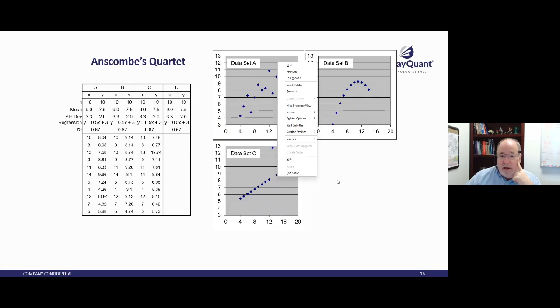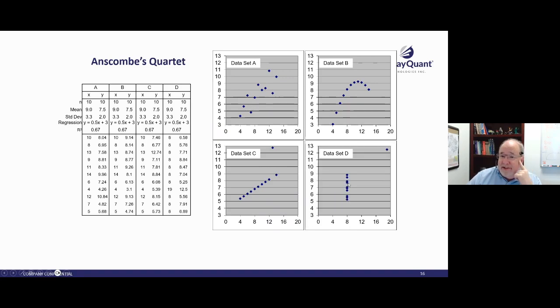You've got a nice straight line like this, but you've got a point that's all the way up here. So your Y-intercept is actually negative. Your slope is significantly lower than this data set here, but it's all offset because of this one outlier. But it still has the same numbers. And by the same token, here's data set D. Everything's 8 except for this. If you crunch the statistics, it looks exactly the same as the other 4 data sets.